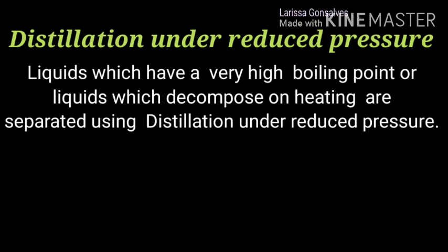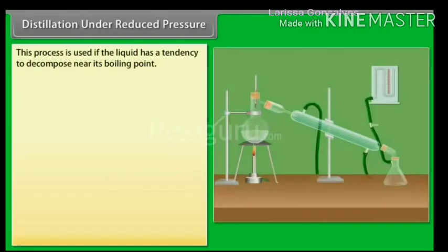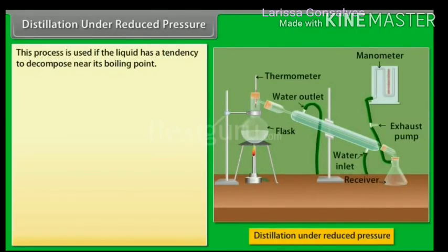In soap industries, glycerol is separated from soap using this technique. Let us now watch a video to get a concrete idea of this process. Distillation under reduced pressure. This process is used if the liquid has a tendency to decompose near its boiling point.